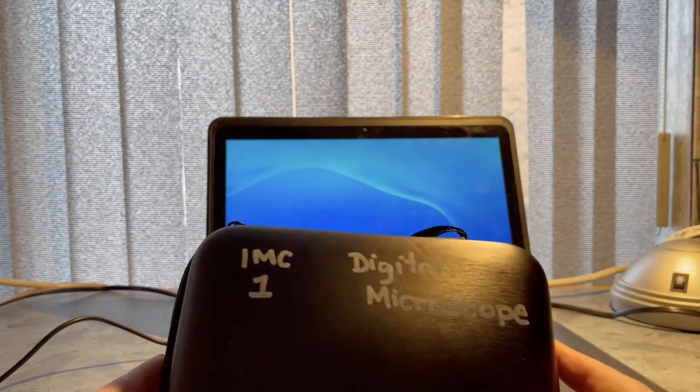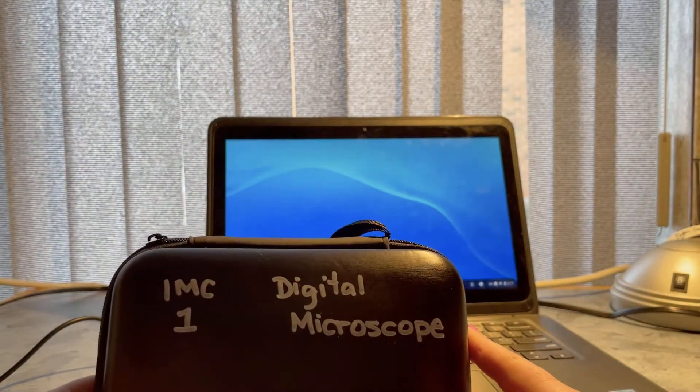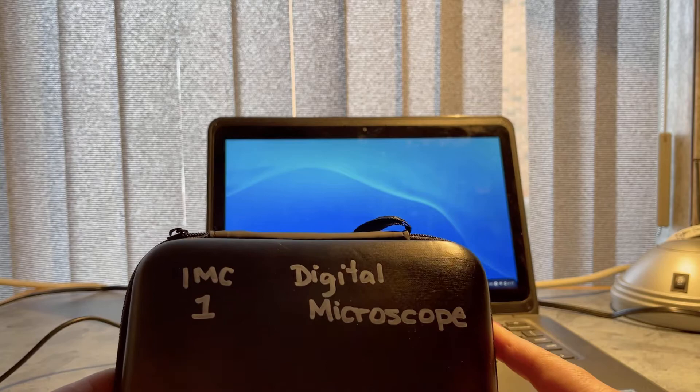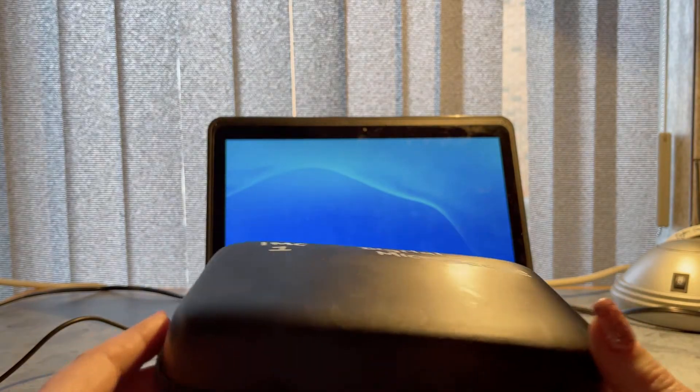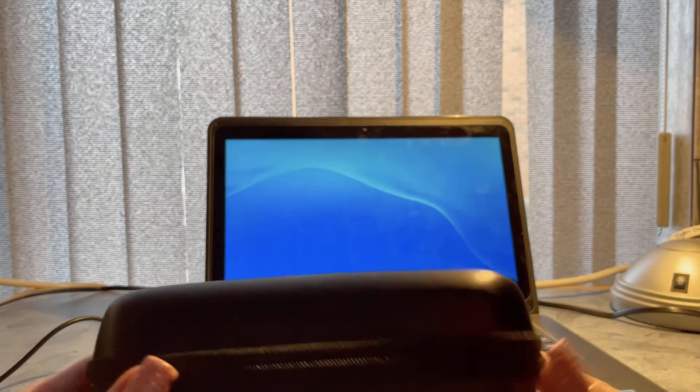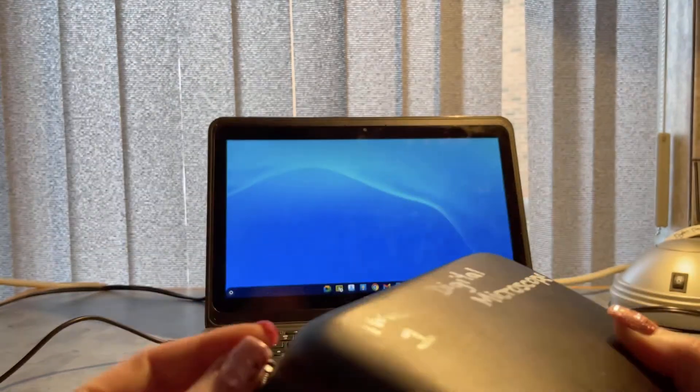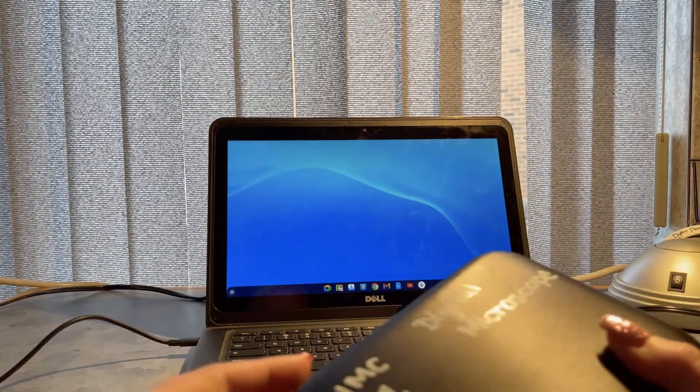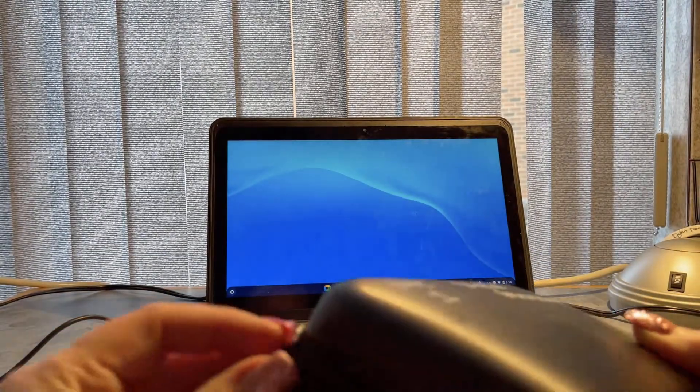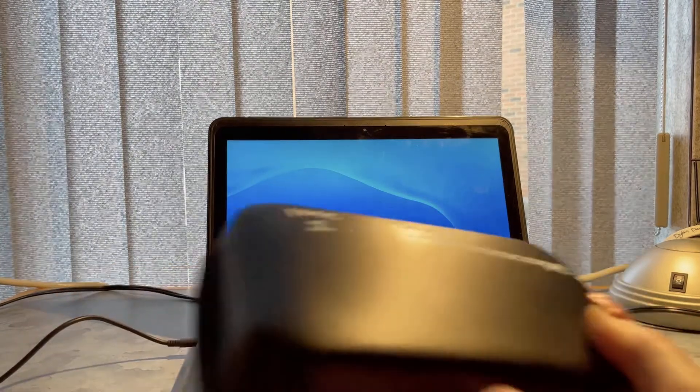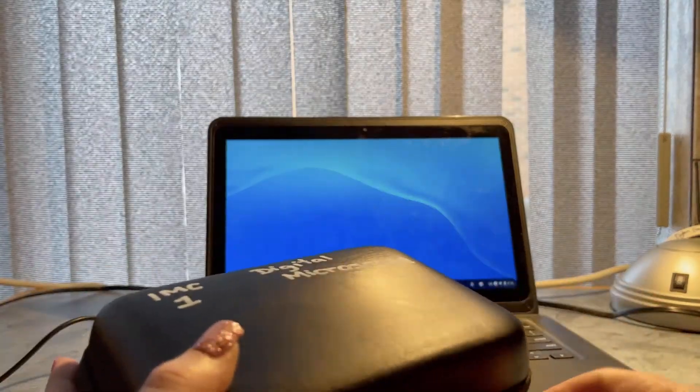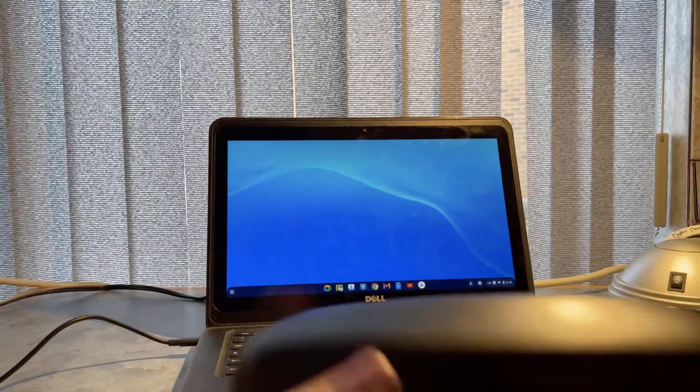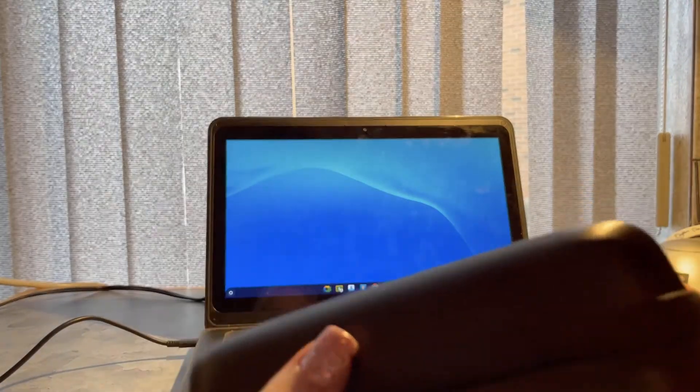This morning we're going to take a quick look at how to use one of these digital microscopes that we've picked up for the IMC with a Chromebook. This is surprisingly easy.